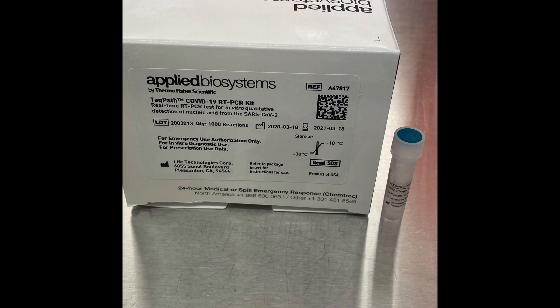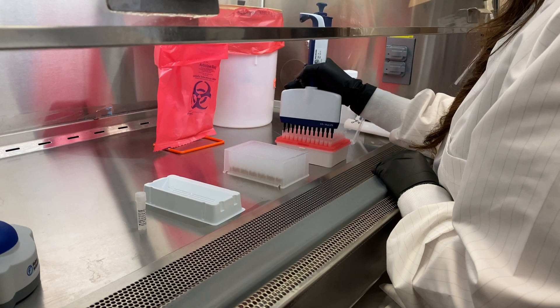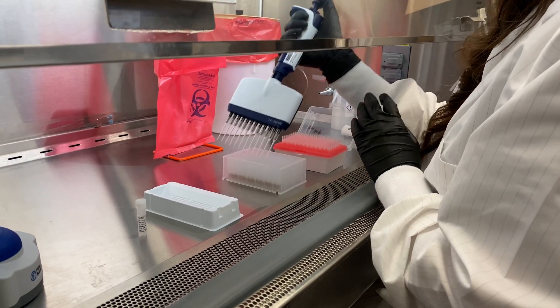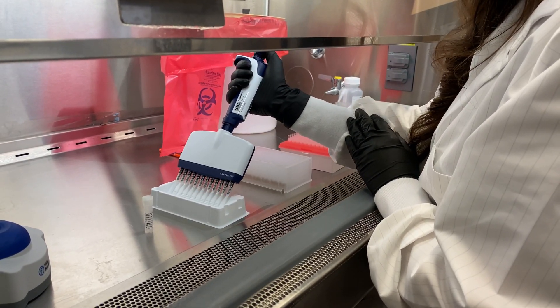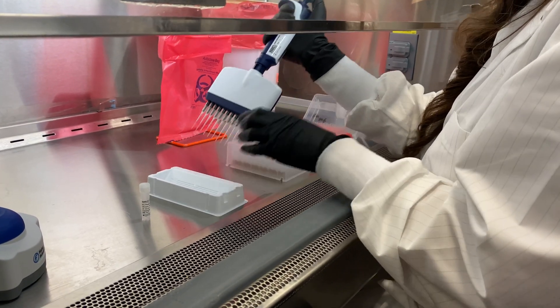Next is the addition of 5 microliters of MS2 phage. The phage serves as a control and must be added to every sample well, as well as the negative control well. Once the phage is added, the deep well plate is ready to be placed on the KingFisher Flex.